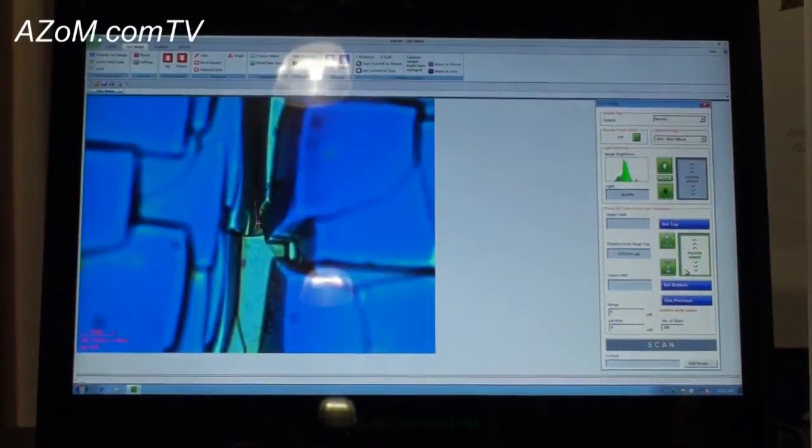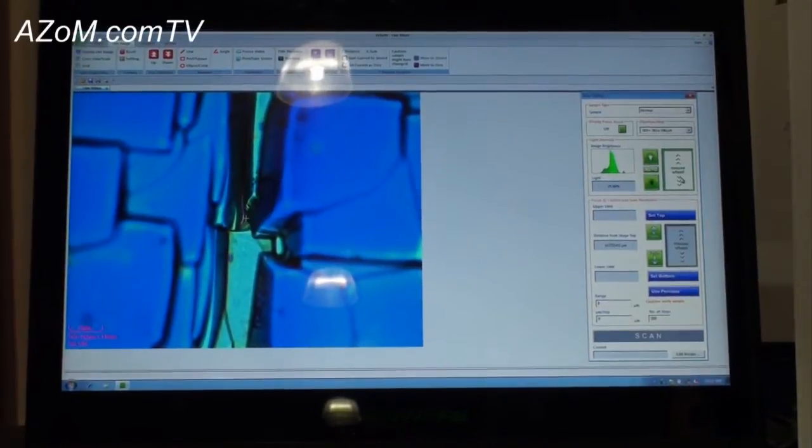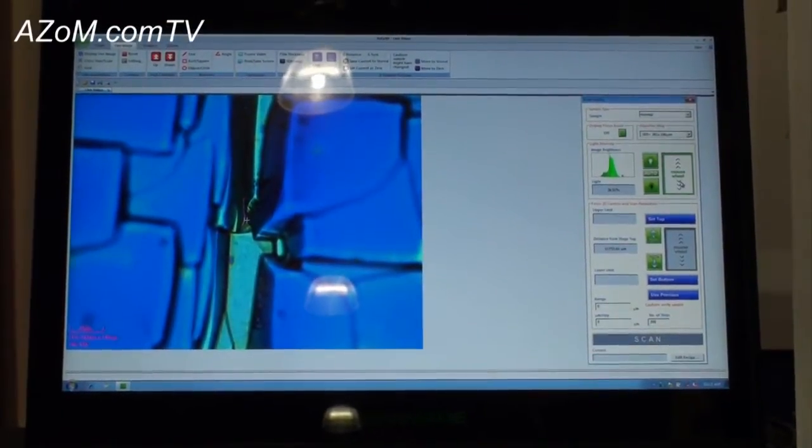What I'm going to do is show you how we can collect this image in less than a minute and build up to 3D. Typically we adjust our illumination control, which is done here, or I can hit auto.